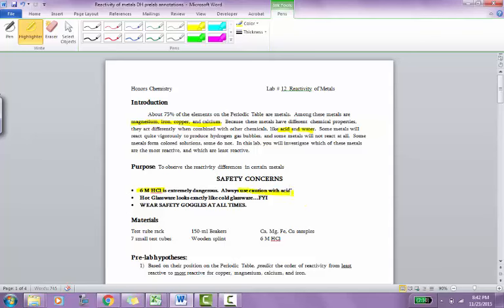If you should spill any, you should let me know immediately. If you spill it on the bench top, you should let me know immediately. If you spill it on your hands, you should let me know immediately. Get the picture? You're going to wear goggles at all times when you're in the lab, especially when you're cleaning up. Don't want to see you take the goggles off until you're done cleaning up.